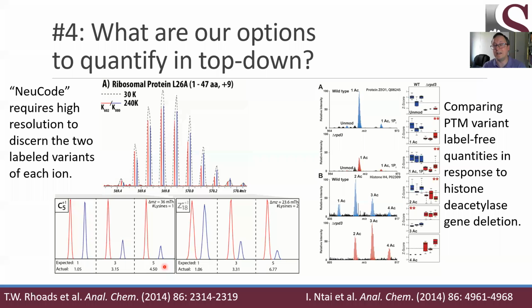Now, can you do that for all ions? Are all ions going to be ratioed so closely as that? Probably not once you get down into the grass, but at least for some of the proteins, you're going to have the ability to do a very careful quantitation of how much difference there is in them. And as we mentioned previously, you may also want to ask about how much you're shifting from one proteoform to another. So here, developing ratios in that space.